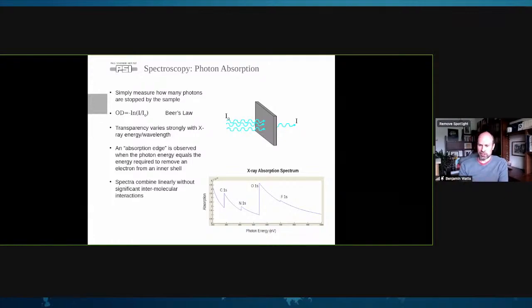Now, when we look at the X-ray absorption spectrum in general, we see that the absorption rate decreases as we increase the photon energy or make the wavelength shorter. And this we can see in the harder X-rays being more penetrating, so they go through materials more easily. So if you think about the classic medical X-rays, these are very hard X-rays. They travel through the flesh, and it's the elements in the bones that really absorb those X-rays, and so we're penetrating through. If we use softer X-rays, so lower energy, then we don't get that same penetration anymore.